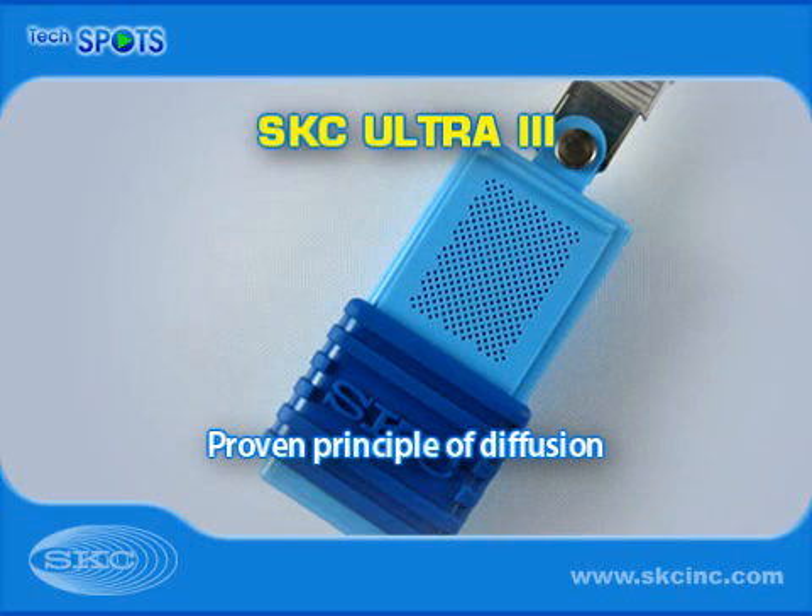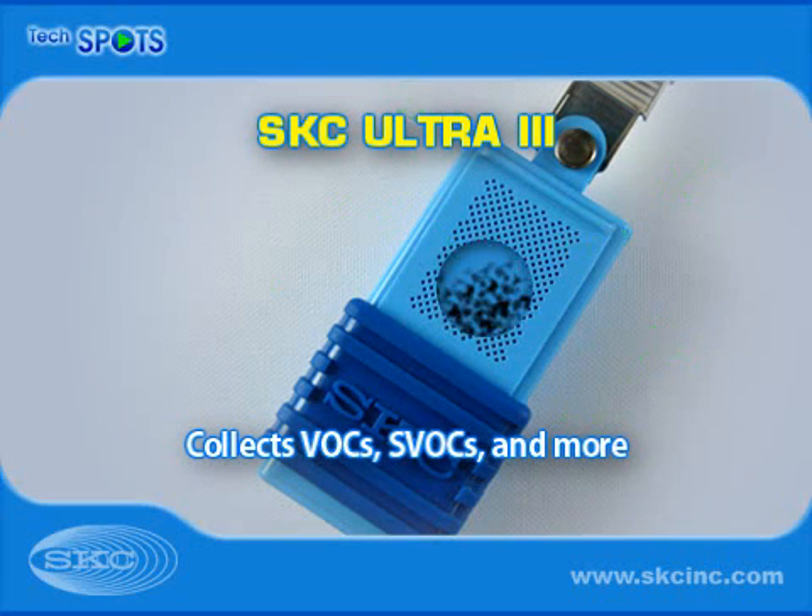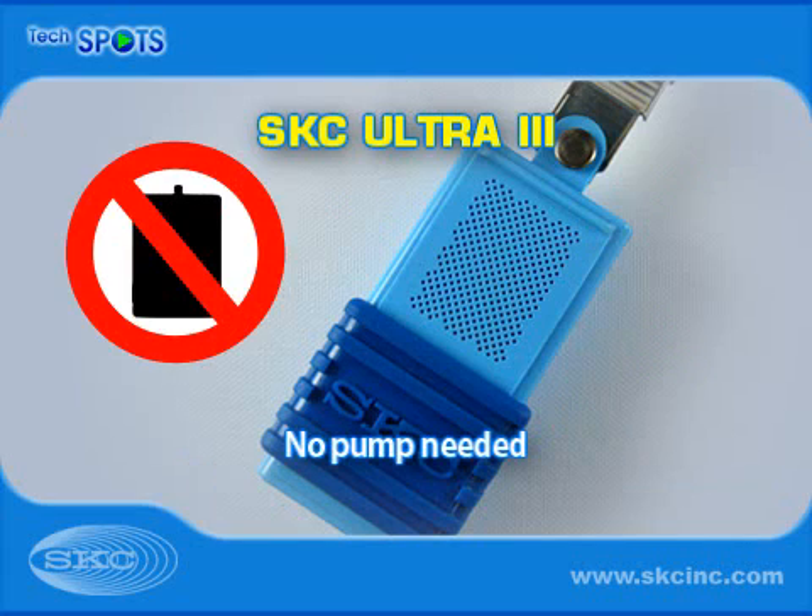Through the proven principle of diffusion, SKC Ultra-3 Passive Samplers effectively collect volatile and semi-volatile organic compounds onto sorbent inside the sampler without the use of a sample pump.